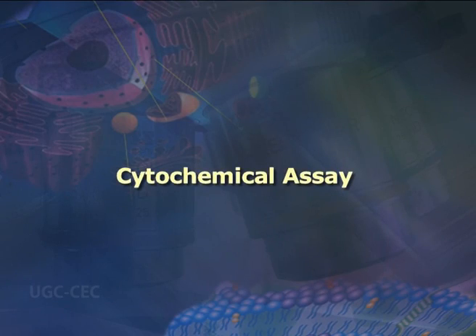Cytochemical assay: fix the dissociated cells for 30 minutes at 4 degrees centigrade in glutaraldehyde 2.5% plus sucrose 1% in fresh saline water. Then wash in phosphate buffered saline and stain according to the cytochemical methods reported below.